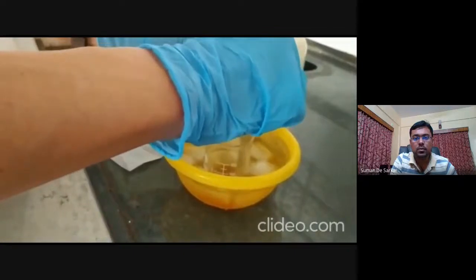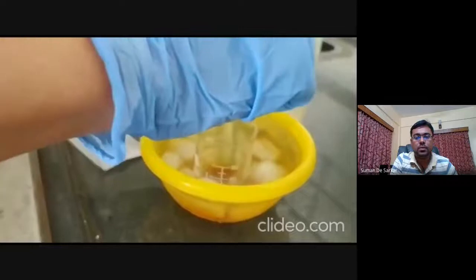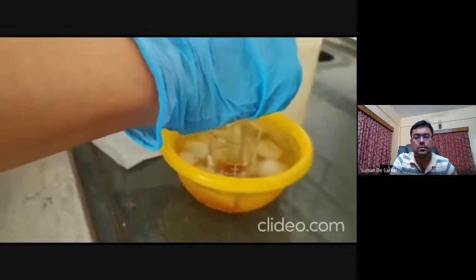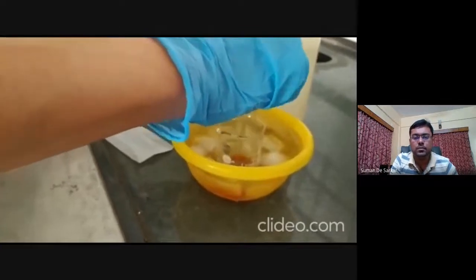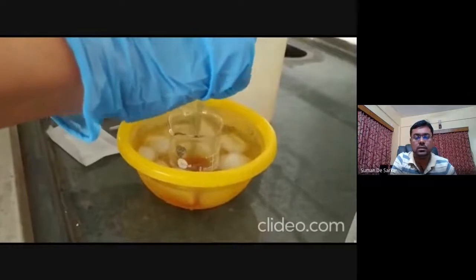See, it's getting brown. Yeah, you see? Yeah, brown to red. HCl to the NaNO2 sulfanilic acid. Actually, everything was colorless.